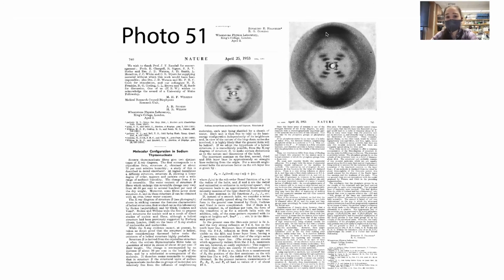So the fact that we can see them is telling us that they're fairly horizontal, but the fact that they're in this arc is telling us that they're not quite horizontal.